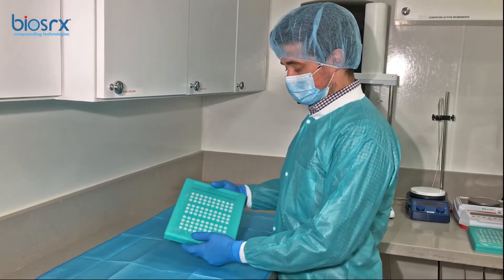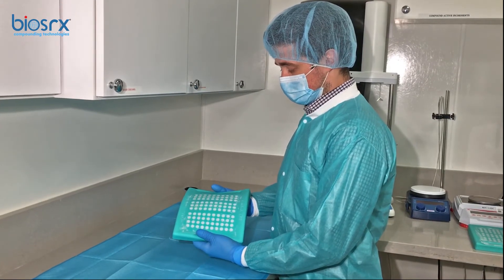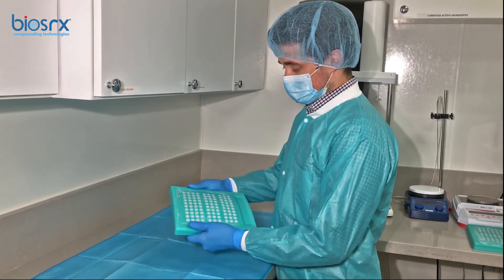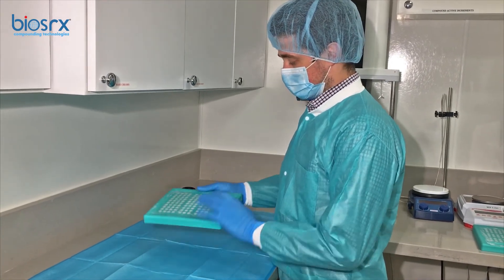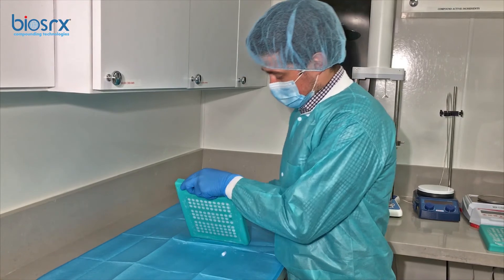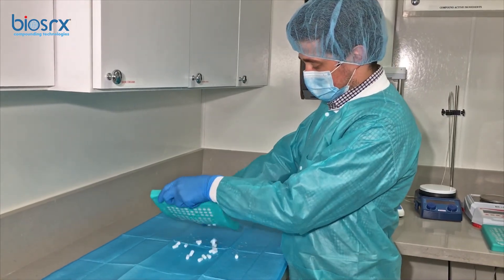We're going to loosen up the cavities — we're going to bend the mold. All it really takes is just bending it and the cavities should come right off.